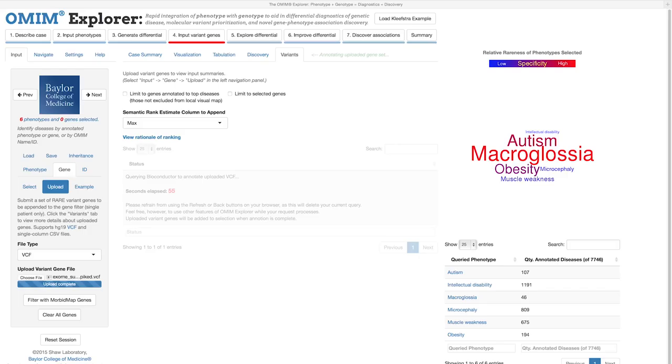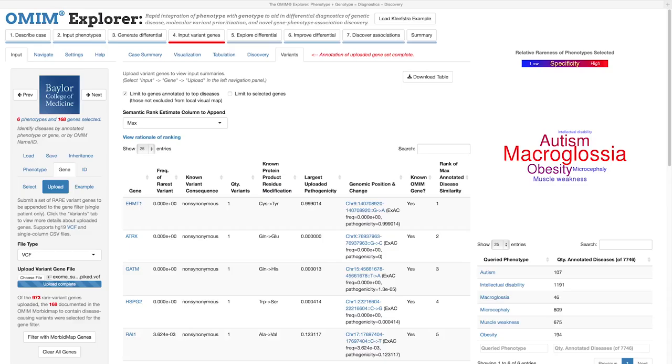Now we can see a list of the genes that were present in the VCF we uploaded, complete with identity, frequency, and pathogenicity information for the variants they contain. We also immediately see that the known causal EHMT1 variant is prioritized at the top of the list.